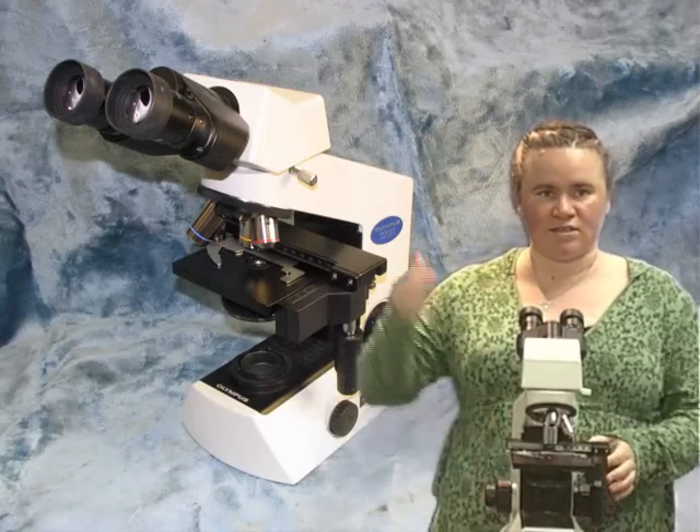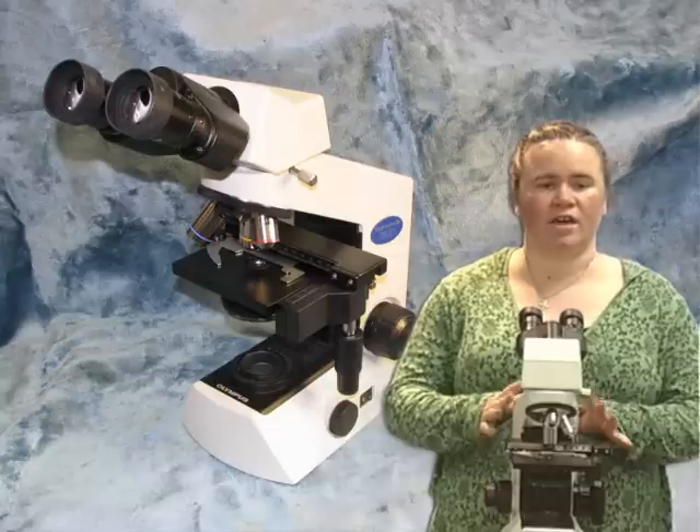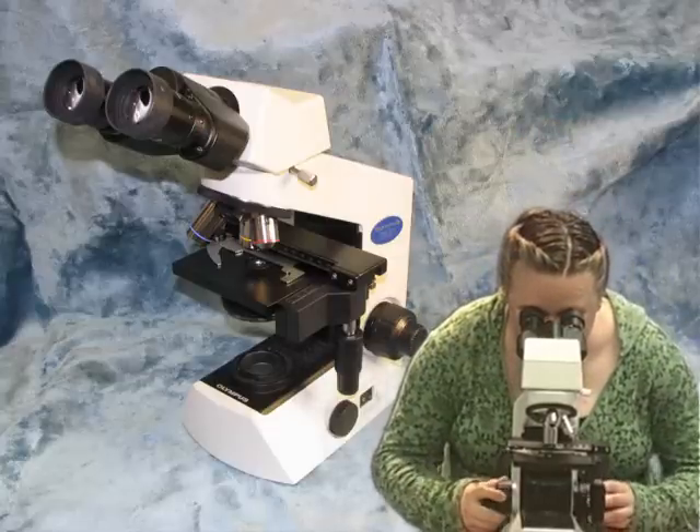Alright, this video clip is going to look at how we can make adjustments to the microscope for you personally to use it. They come out of the cabinet just like this, just like the picture behind me, and you can use them this way and it'll be perfectly acceptable for you if this is how you're comfortable.